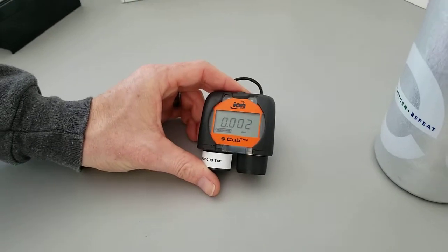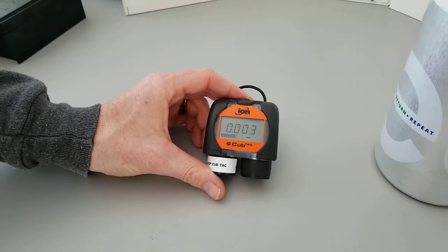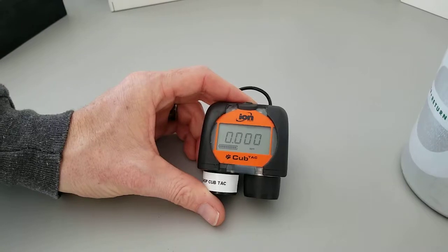In this video we're going to run through the manual calibration of a CubTack instrument. The equipment we'll need, first of all, will be a CubTack.